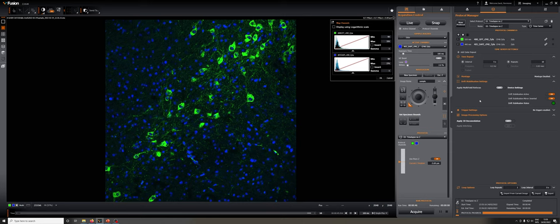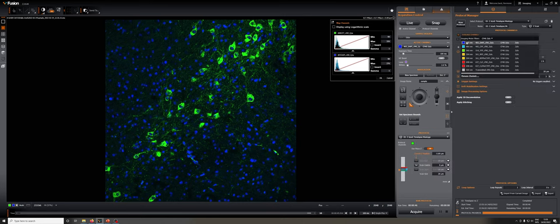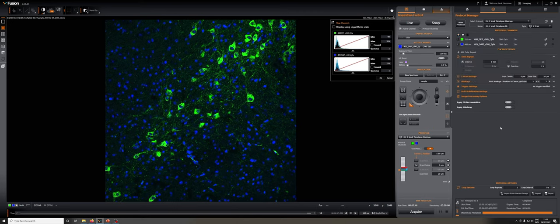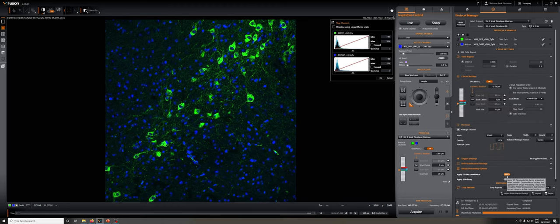So if we click on that protocol, again, we will have to add whatever channels we want to. I'll add the DAPI here. Now we will have time options, Z options, and montage options altogether.